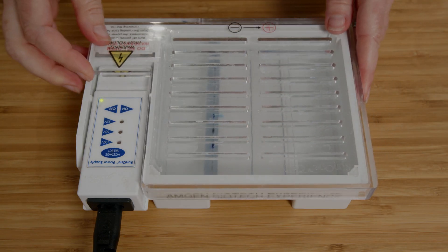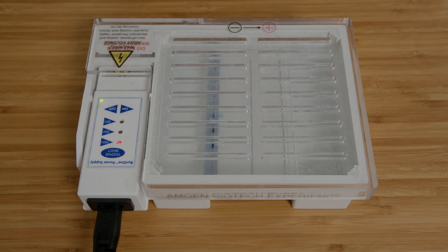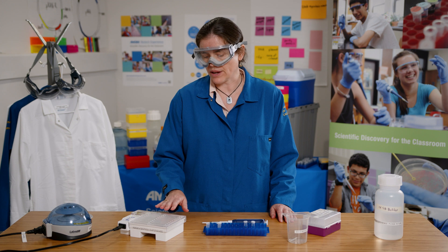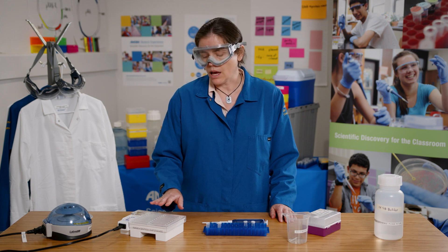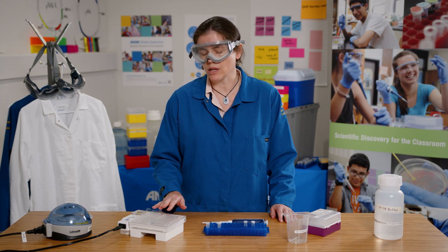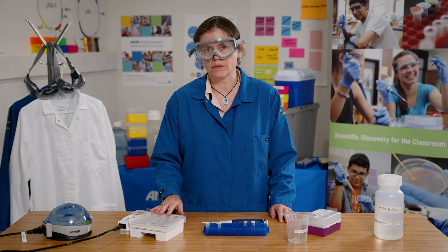Now I can press on, make sure that the gel is running at 100 volts and allow my gel to run. Similar to lab 1.2, I need to allow the gel to run until the yellow dye is halfway to three-quarters down the gel. I know that my DNA fragments are bigger than the yellow dye fragments but smaller than the purple dye fragments, so they'll be between those two dyes on the gel.